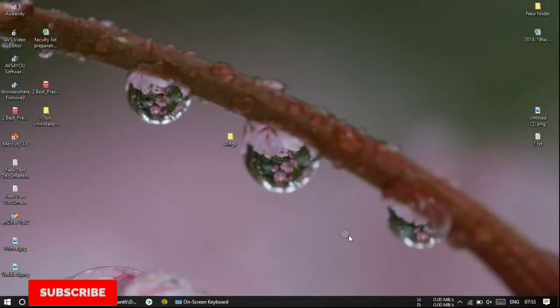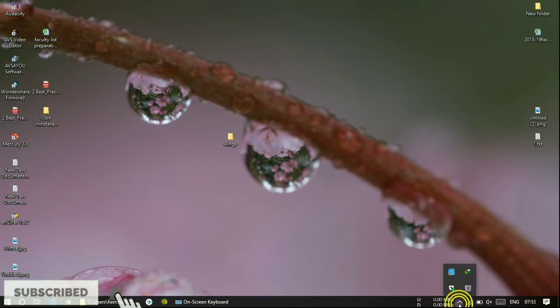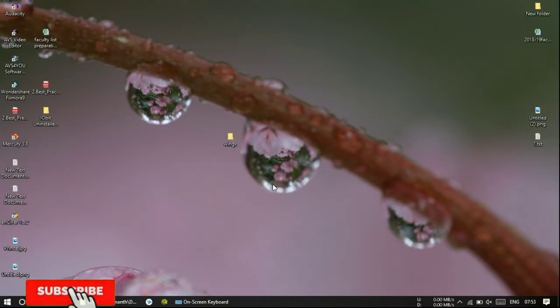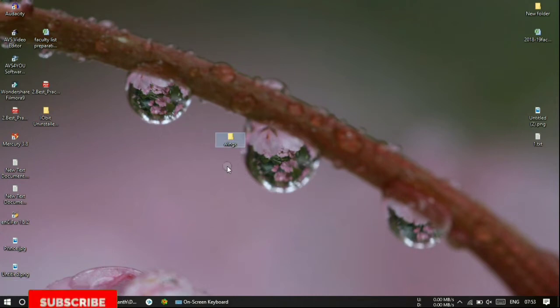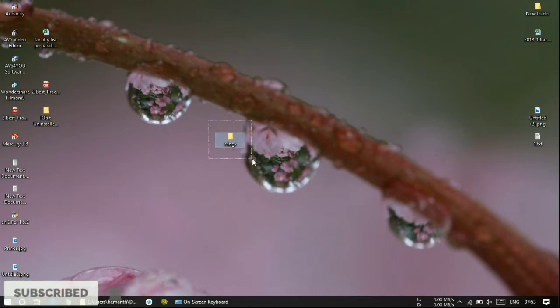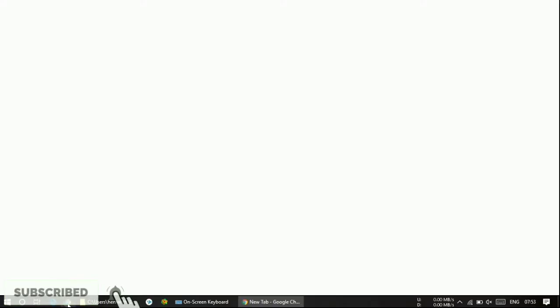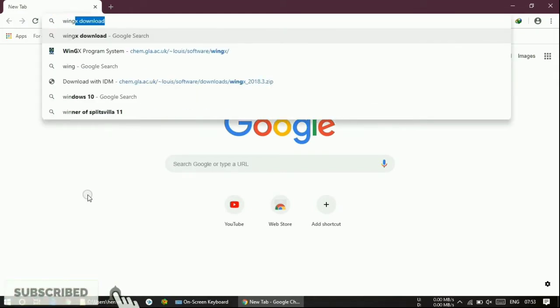In this video, I am going to show you how to download or install WinGX software. First, let me tell you how to download this WinGX software from the internet. Let's go to Google. After opening Google, just type 'wingx download'.